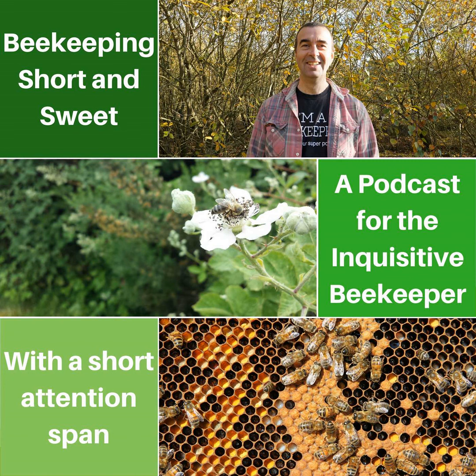One of the things that I'm really keen to do is to catalogue all of the pollen that my bees go out and visit, and making up a pollen slide, as I found, is not that tricky. It's something that most beekeepers could get to grips with quite simply, isn't it?